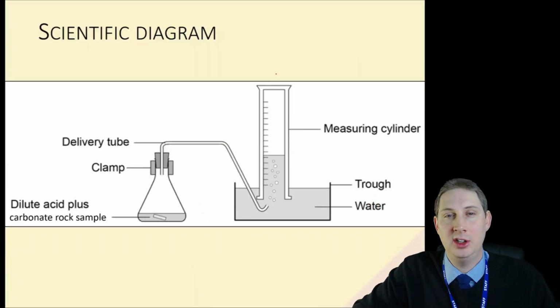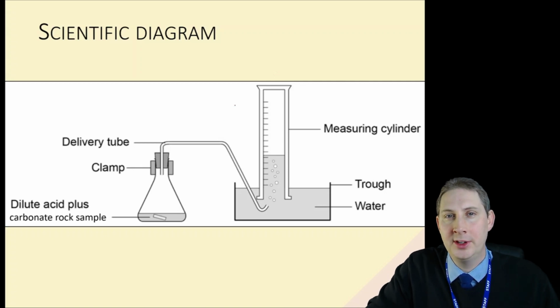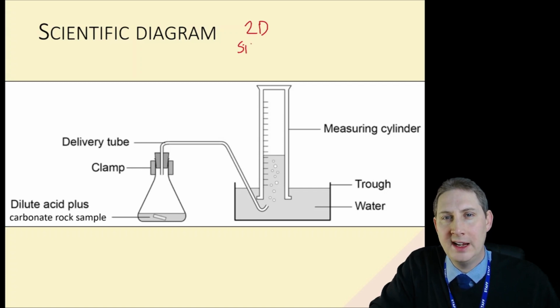Okay, well, for many of you, I expect that experiment is quite close to what you had envisaged. So this is the scientific diagram. Notice that the diagram is completely two-dimensional. It is drawn using straight lines.